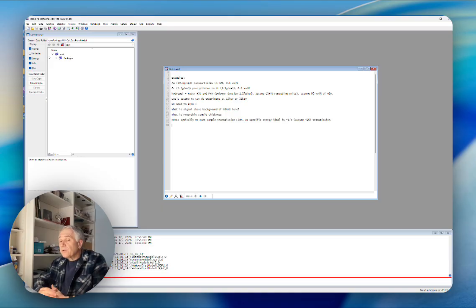So when you apply for beam time at the USAXS instrument, one of the important things we need to know is what X-ray energy you want to use. We have a synchrotron, and our instrument can operate somewhere between 10 kiloelectron volts and 30 kiloelectron volts. About 28 is the maximum energy we normally offer to users.